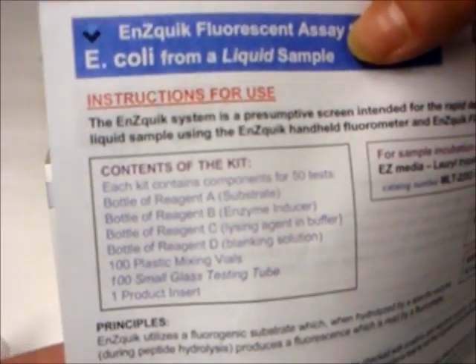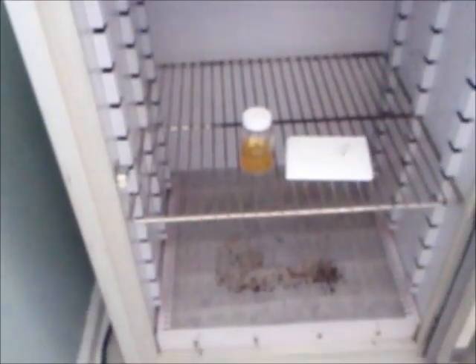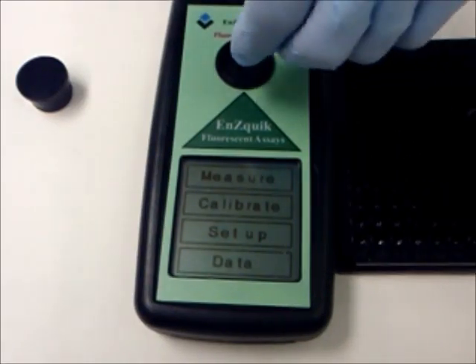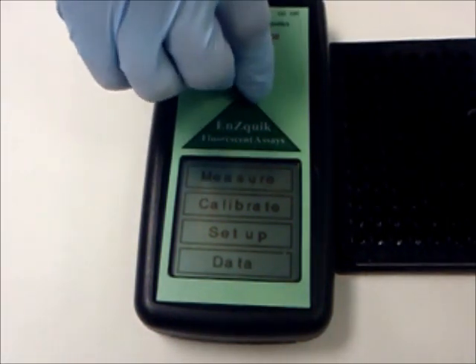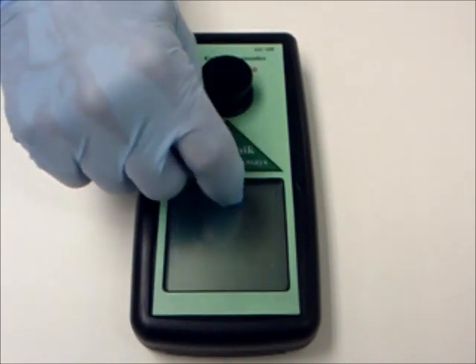Follow the steps as instructed in each product insert by adding the reagents to your sample, awaiting the specified time, or incubating your sample if required. Place your sample into a philometer test chamber and secure the philometer cap onto the test chamber. Push the measure button on the touch screen, per the instructions, and record the result.